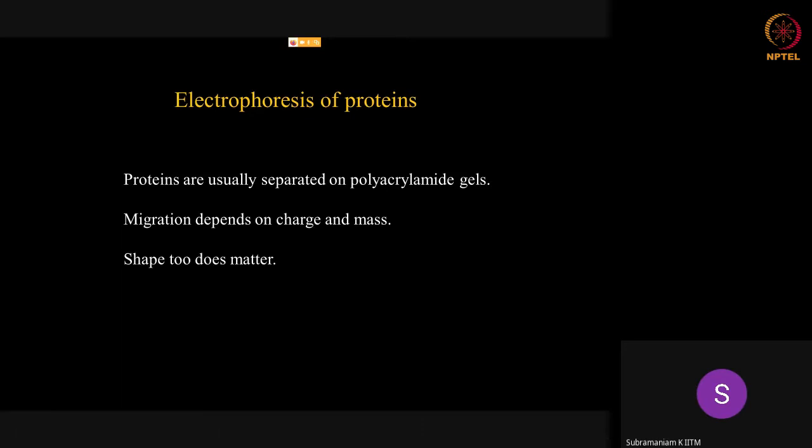Sequencing is done by synthesis, and those synthesized nucleic acids are short oligonucleotides. But in the case of proteins, polyacrylamide gels are the dominant kind of solid matrix we choose. This is the primary way by which electrophoretic separation of proteins is done.